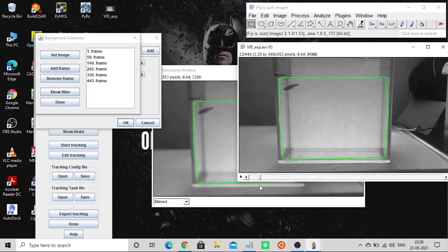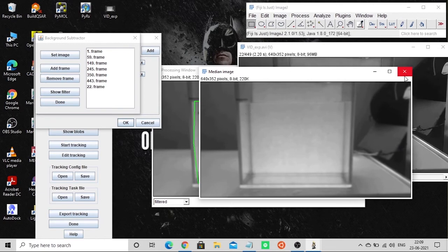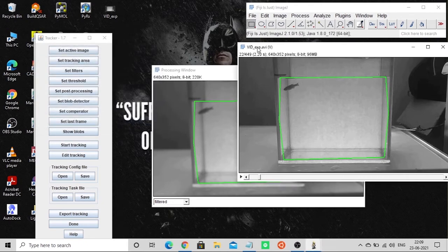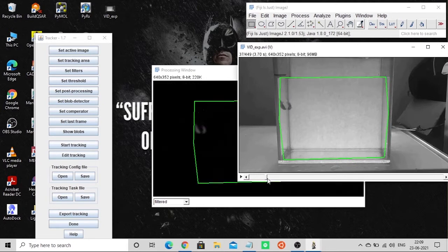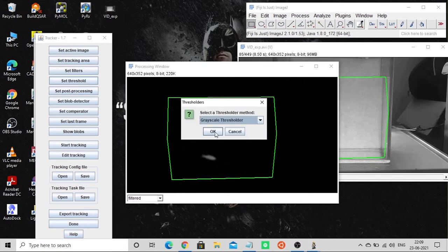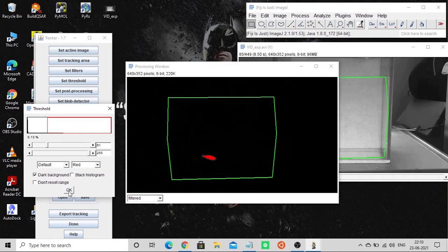Go all the way down to make sure the connectivity is correct. Click Show Filter — you can see how the filter looks. Close it and click Done, then OK. You can see in this window how the image moves and how the object is being tracked. Now click Set Threshold — the object has been properly selected. Click OK to set the threshold.